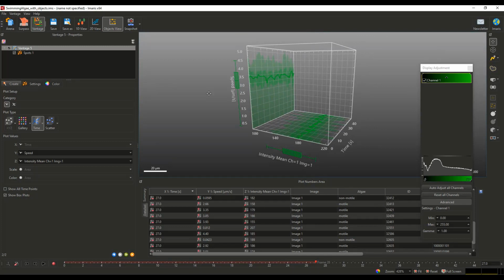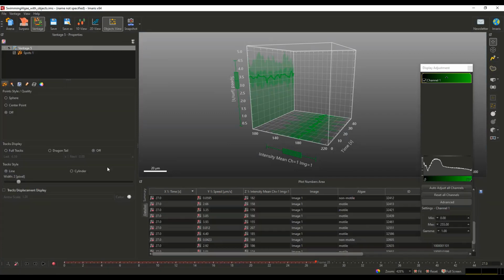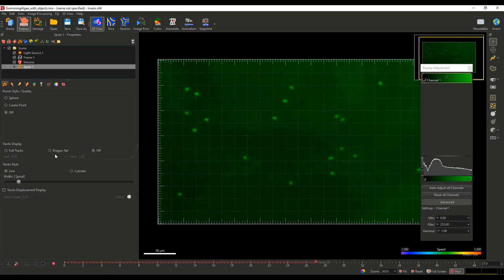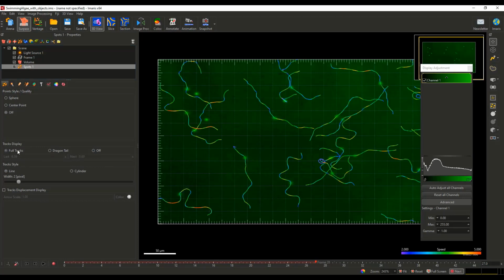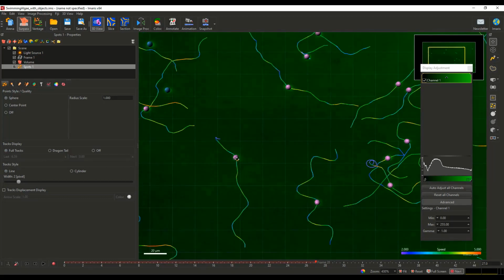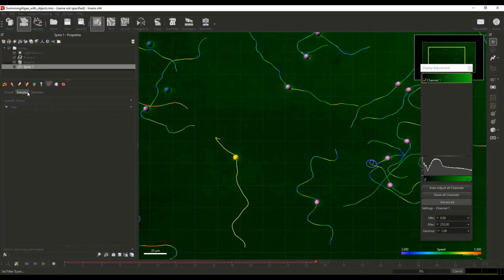Okay, so that's actually all for what I wanted to show you on the different views, the 1D view, 2D view, and the object view. I would like to use this data set here to show you the annotation tool, which is also part of Vantage. So you might have seen on our website that we added some statistical values to some segmented objects. Well, this is actually possible when you go in the Statistics tab.